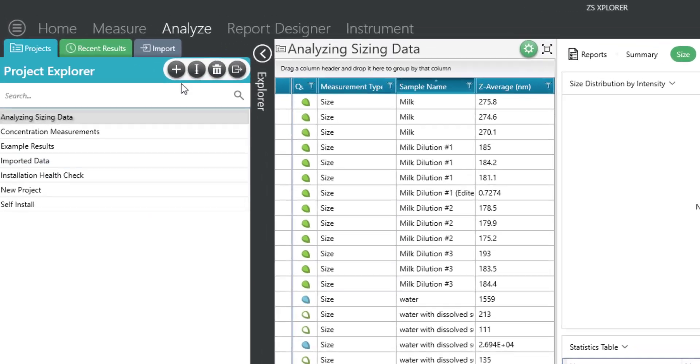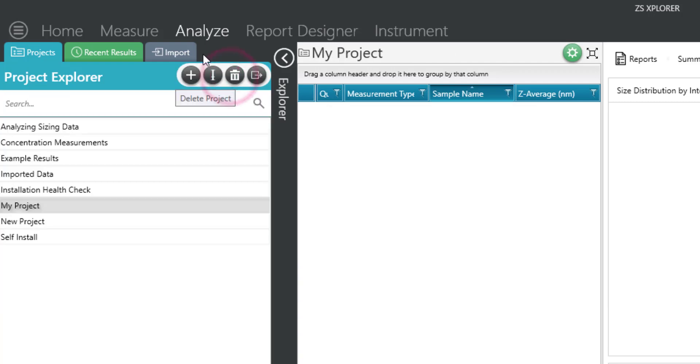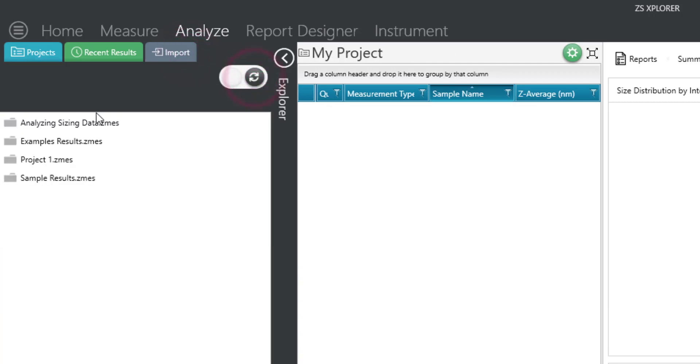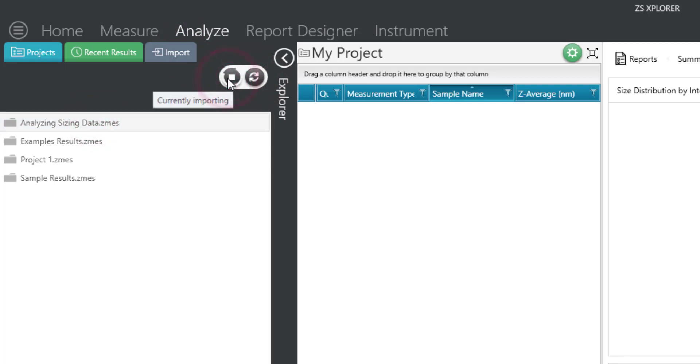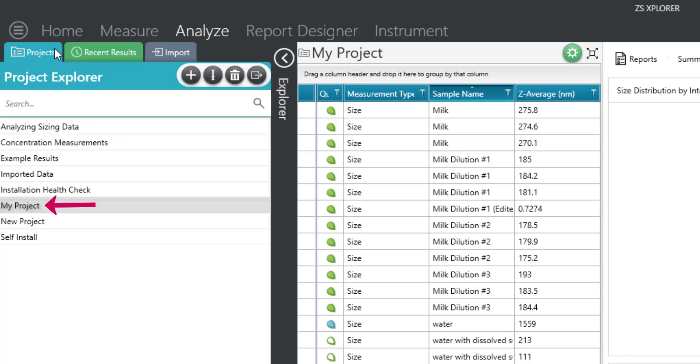First, create a new project name and click the green checkmark. Navigate to the Import tab and hit the Refresh button. Select your project and hit Import. You will notice it is now added to the Project Explorer and available to view.